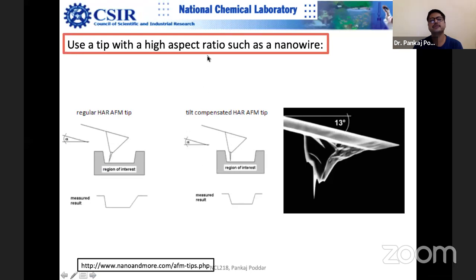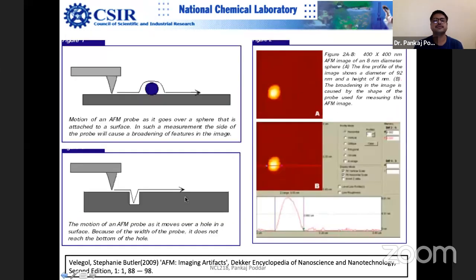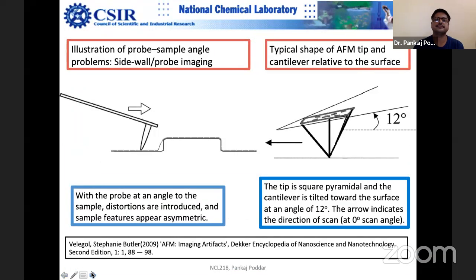There are three adjustment screws on the microscope that allow the user to adjust the tilt angle of the probe. Normally it is capped at 12 degrees, but you can change it. This provision is there and you can do it very easily.